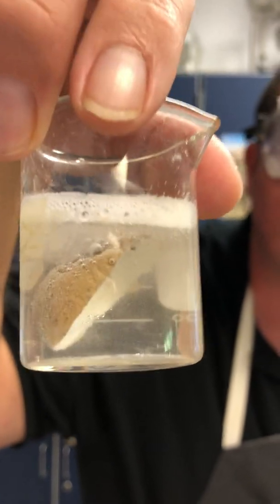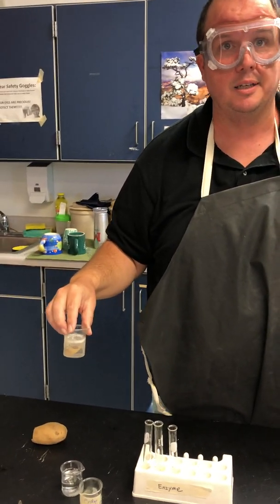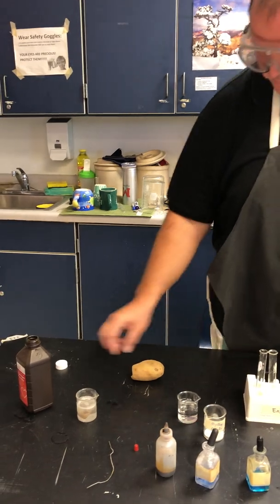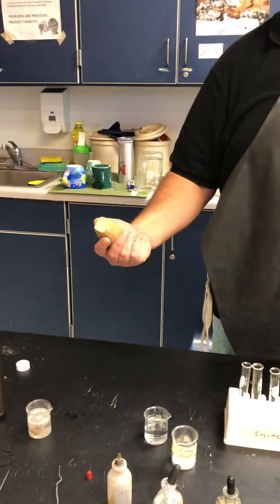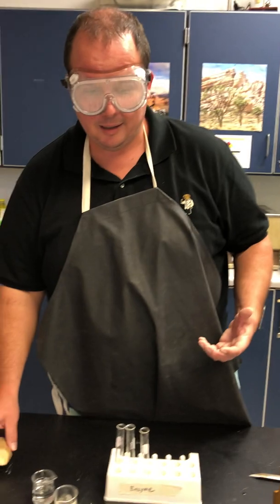Usually you see this if you ever put hydrogen peroxide on a cut: you'll see it foam up, and that's its interaction with the catalase within your skin cells. So, if you just put the potato in plain water, would it not do that? No, it would not. I've got a big potato, it can't fit in, but if I could, I'd put the whole potato in there, and nothing would happen. Good question.